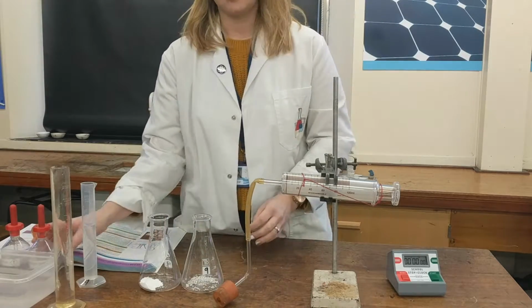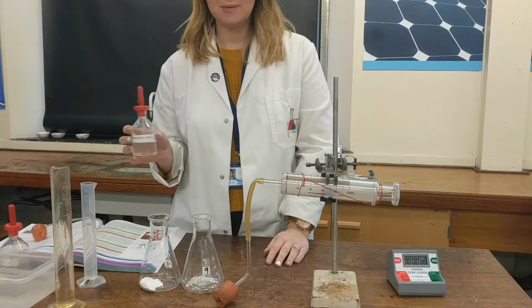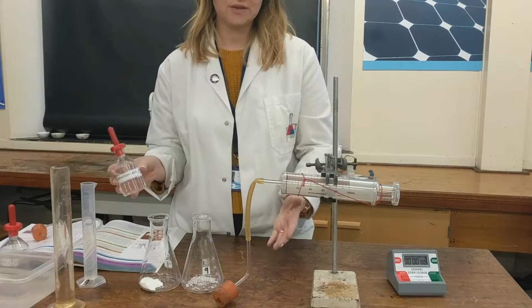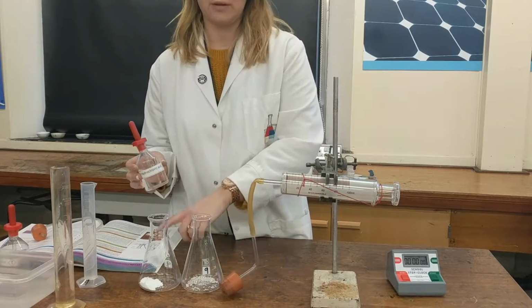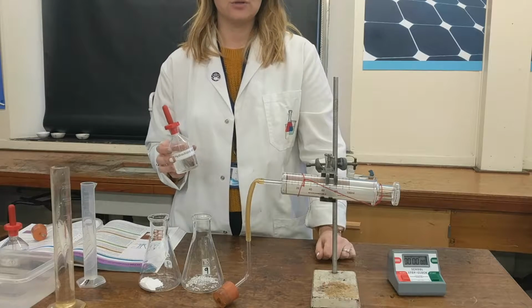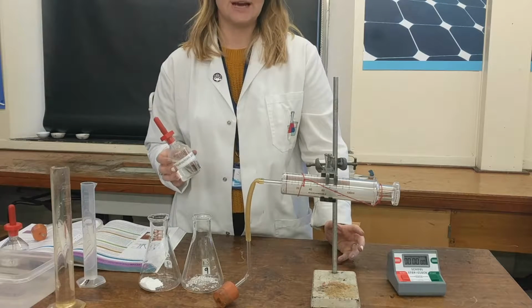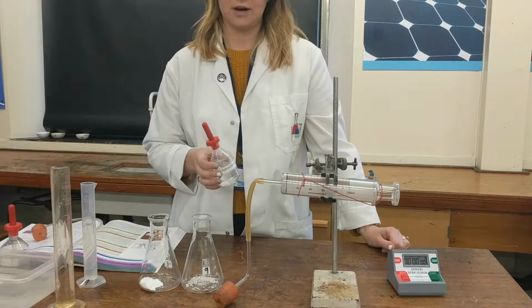You're going to add some hydrochloric acid to that, 40 centimetre cubed. It's going to be the same amount added to each one. So the only different factor here is whether they are a larger chip or whether they are the powder form. So when you've got more surface area exposed, more collisions are able to happen in a certain amount of time. Hence it will give it a bigger rate of reaction.